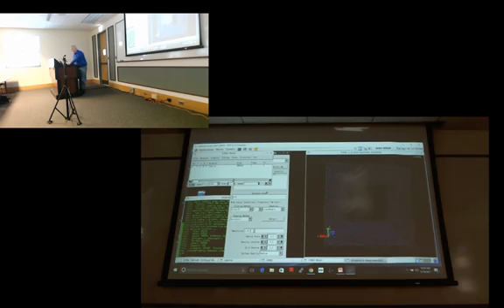So another thing that's interesting about VMD is that it really works by superposition of a bunch of different graphical representations. So I just created that one. I can create another one. I just cloned it. But now I'm going to change the atom selection. I'll say protein.